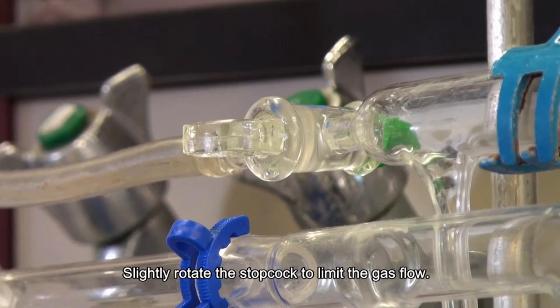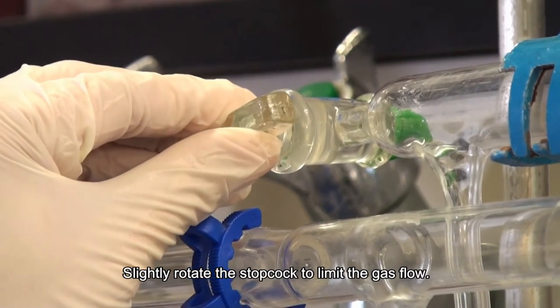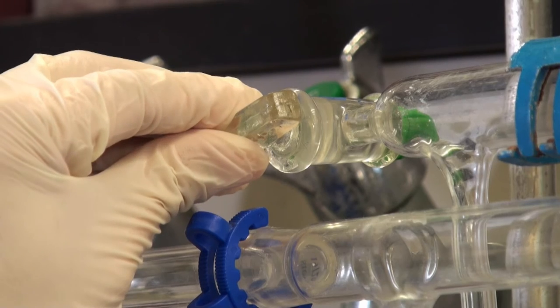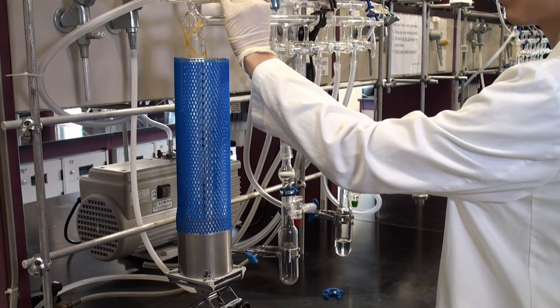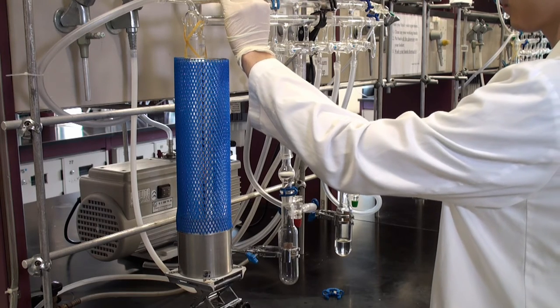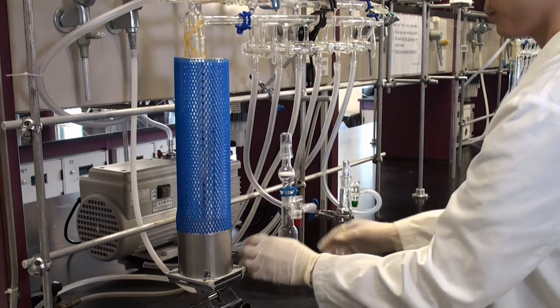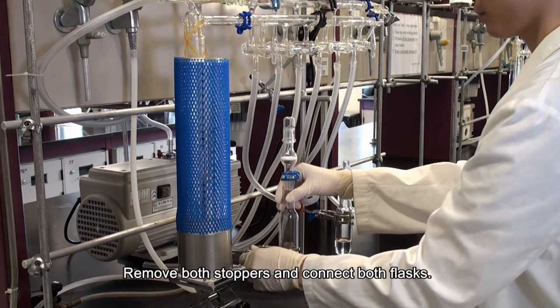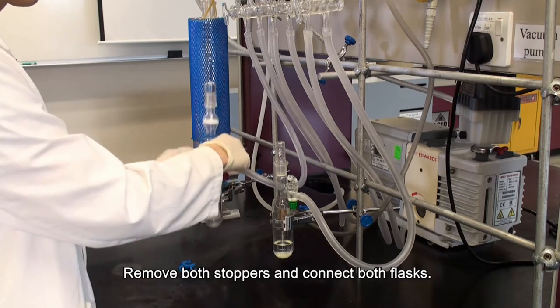Slightly rotate the stopcock, increase the gas flow to the Schlenk flask. Remove both stoppers and connect both flasks.